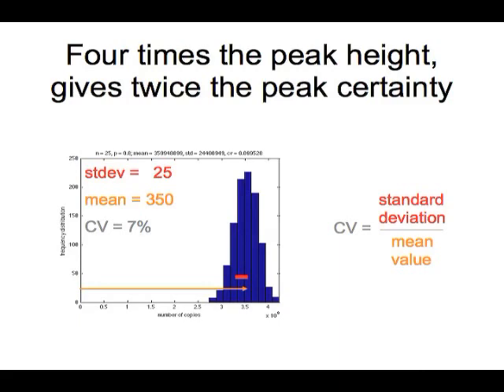If you see the ratio of the red width to the orange extent. And the way you see it is that the peak is much more concentrated around the region of the peak height with a lot more white space of where it can't be underneath it. Whereas in the previous slide, the peak, the probability distribution of the peak, occupied much more relative area with far less white space. That's, by the way, the easiest way to see it. Here it's taking up half, and here it's taking up a quarter. It's the white space.